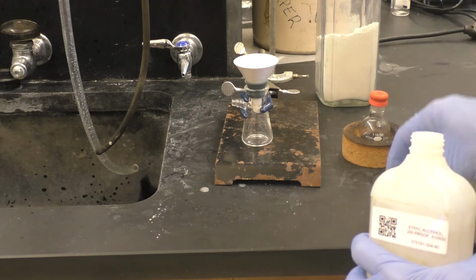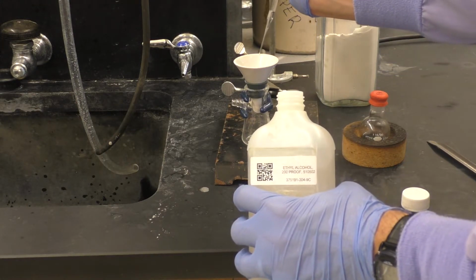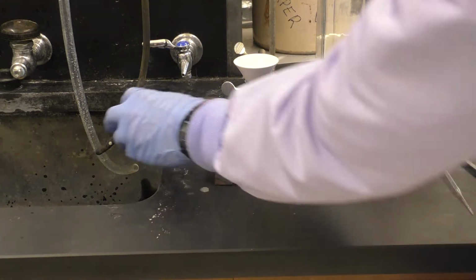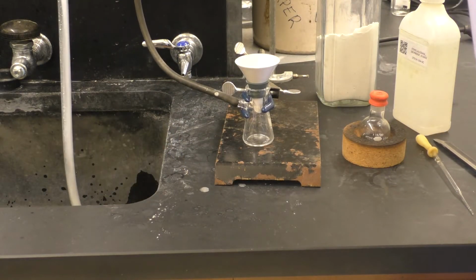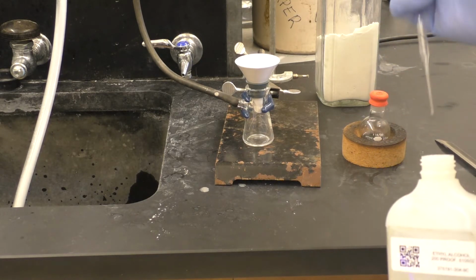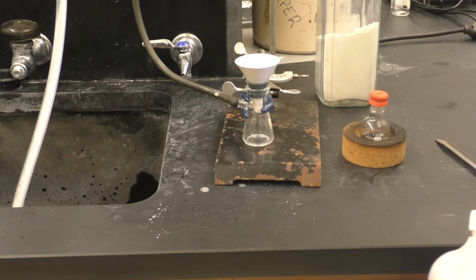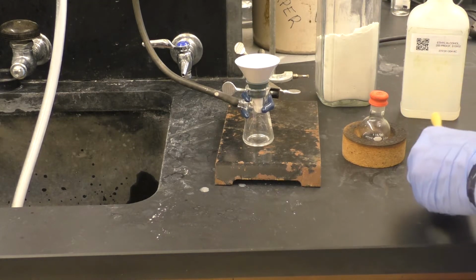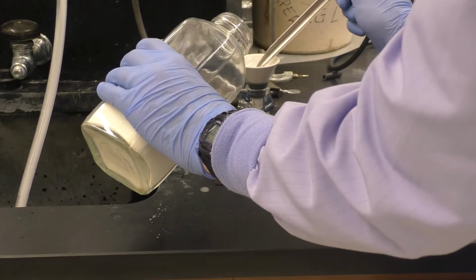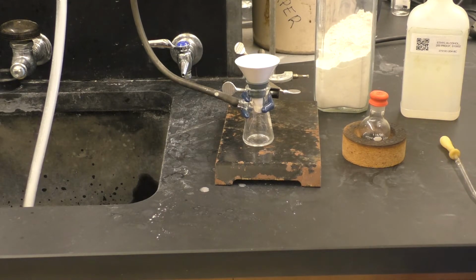This time I will rinse with a small amount of ethanol to make sure that my filter paper really adheres to the filter. So now I really should have a good seal between the filter paper and the Hirsch funnel. I'll just wet it a little bit more just to make sure. Now I should be good to add my Celite without worries of the material going through. We're now all set to filter.